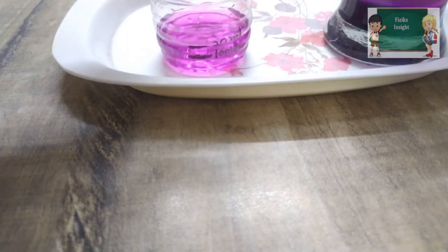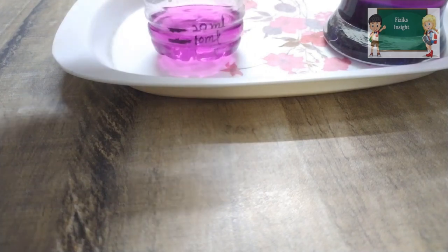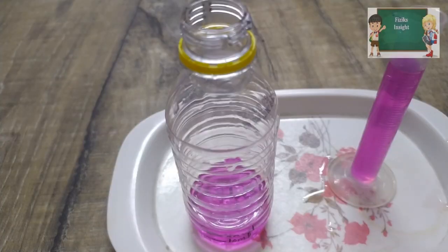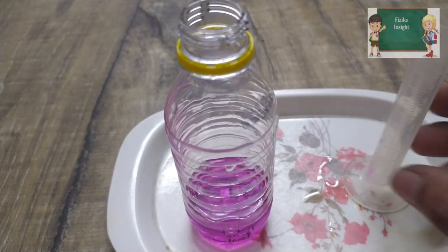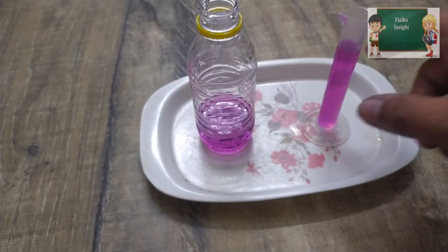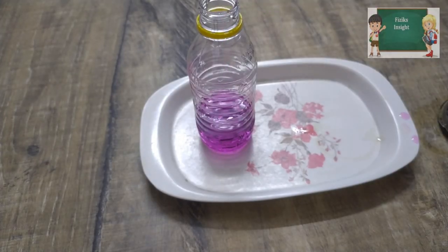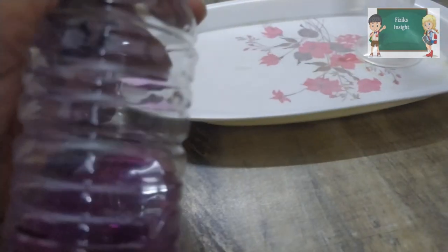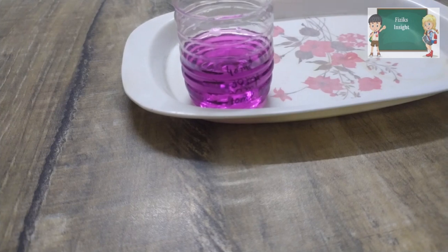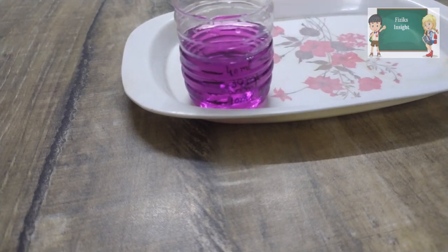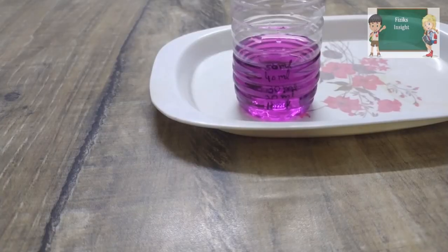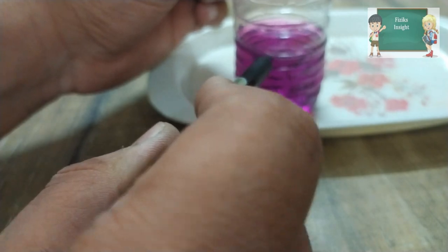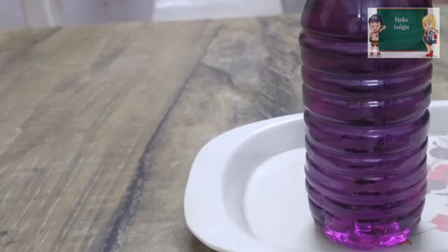Now repeat the same process for the desired capacity. We have done this 16 times to get a 160 ml cylinder. So do this for a longer period.